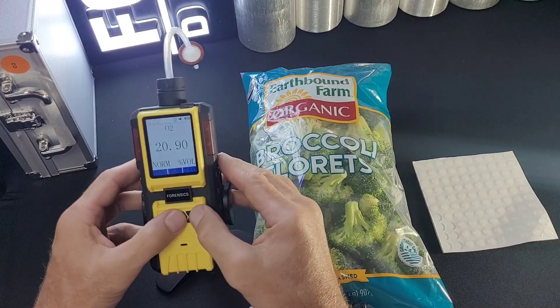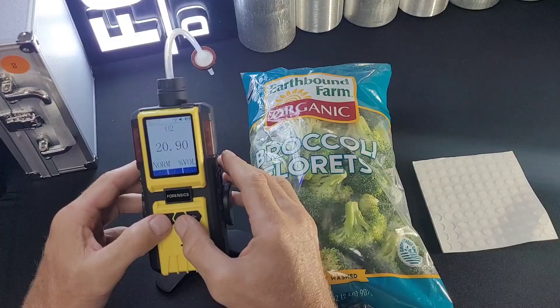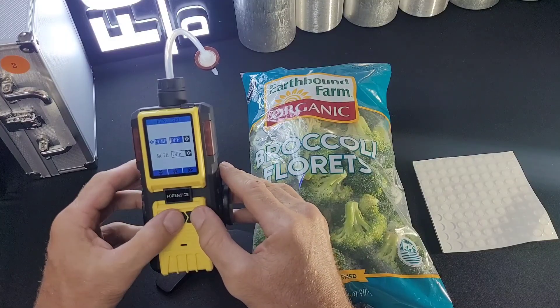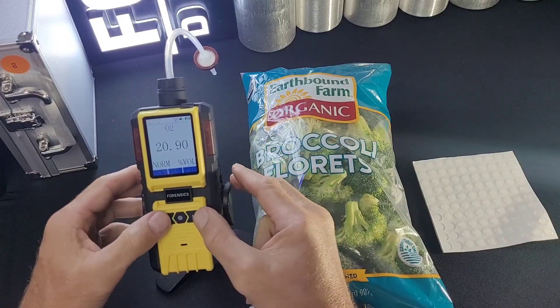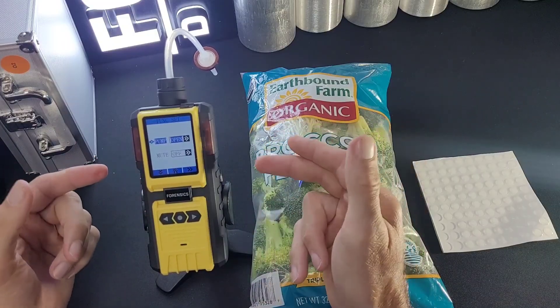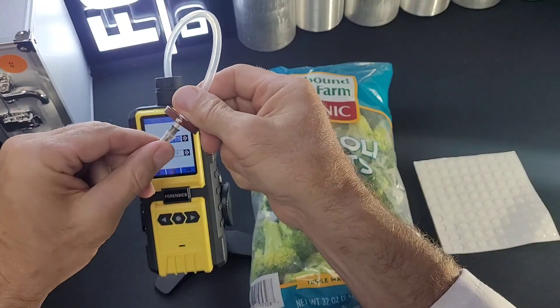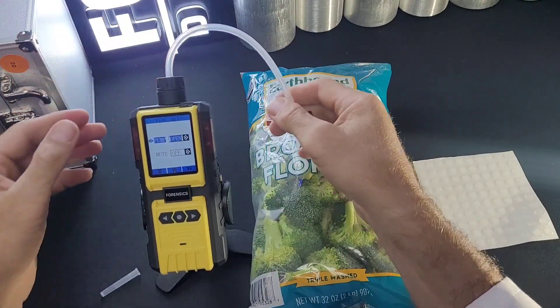Now, when you turn on the unit, the pump will be working. I will show you how to turn it on and off. You're at the main menu at the home screen — press the left button. It says pump, it's off. Press the right button to toggle it and the pump turns on. It is ready for a headspace analysis. Air is being drawn from the needle and into the unit.